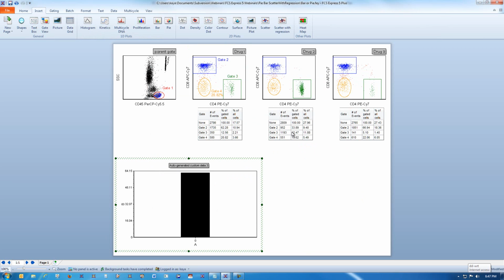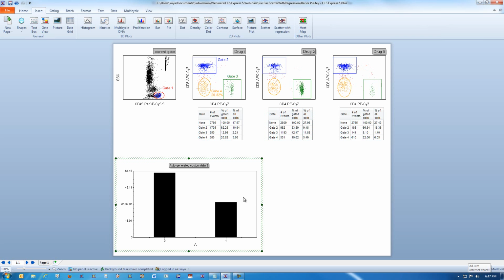I can also grab statistics from default statistics windows or from tokens that reside elsewhere on your layout, such as in tables and the like. So I'll grab this one over, drop it in, okay? And lastly, let's grab this one. So I could actually replace a bar if I wanted to. I'm going to undo that because I really want to add this in as a new bar.